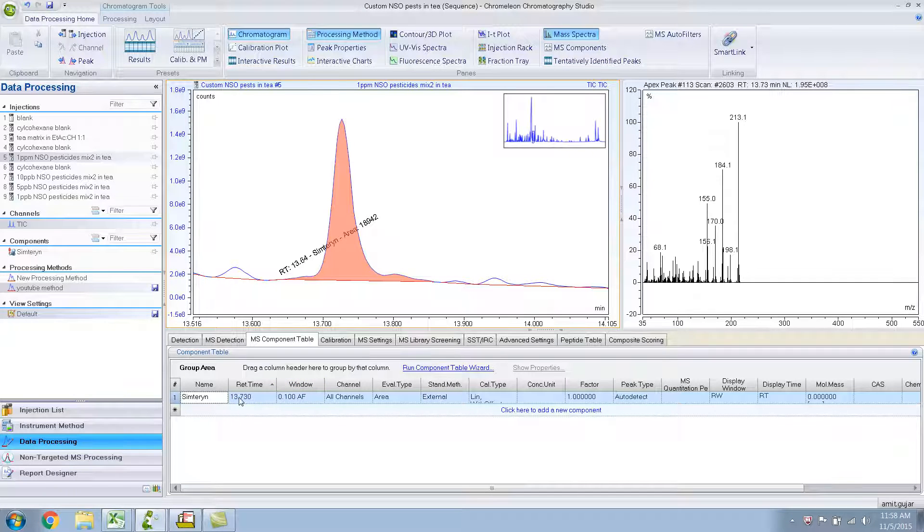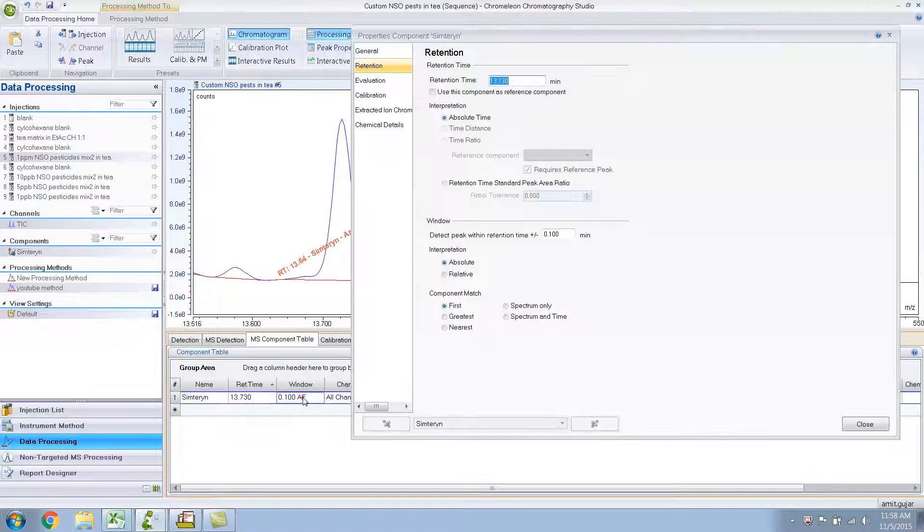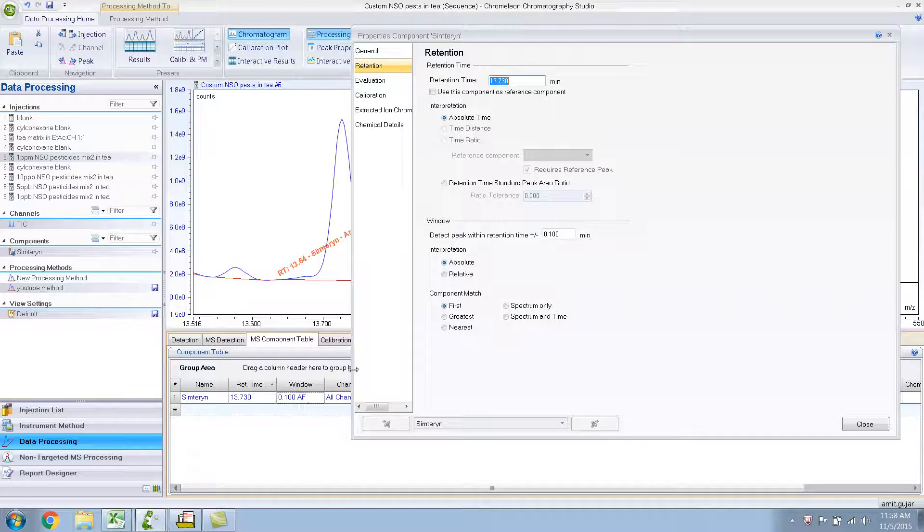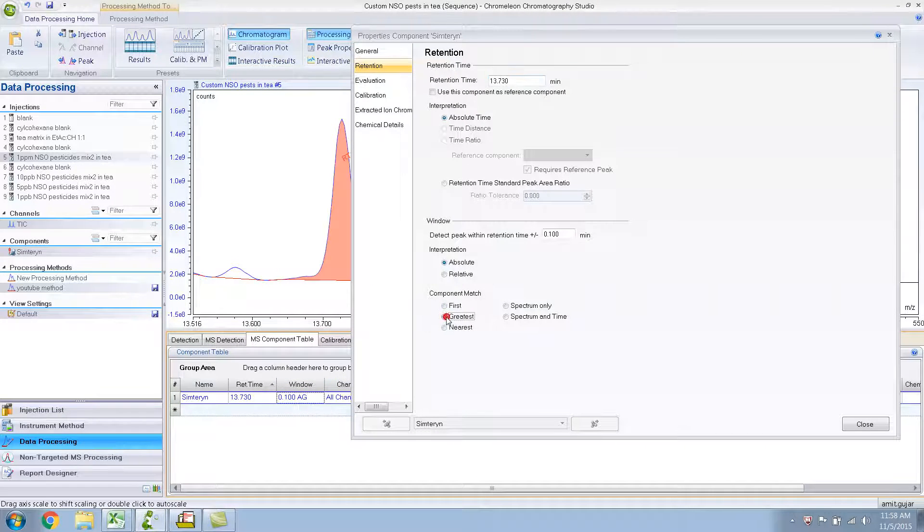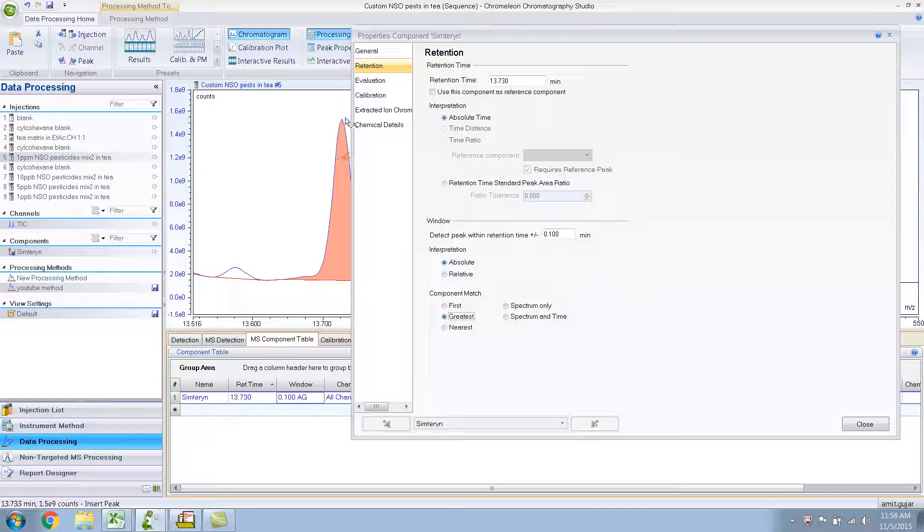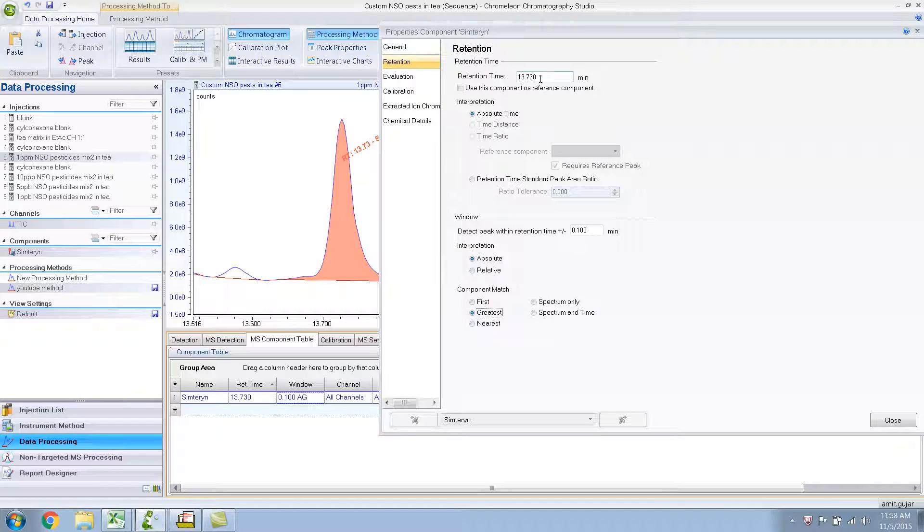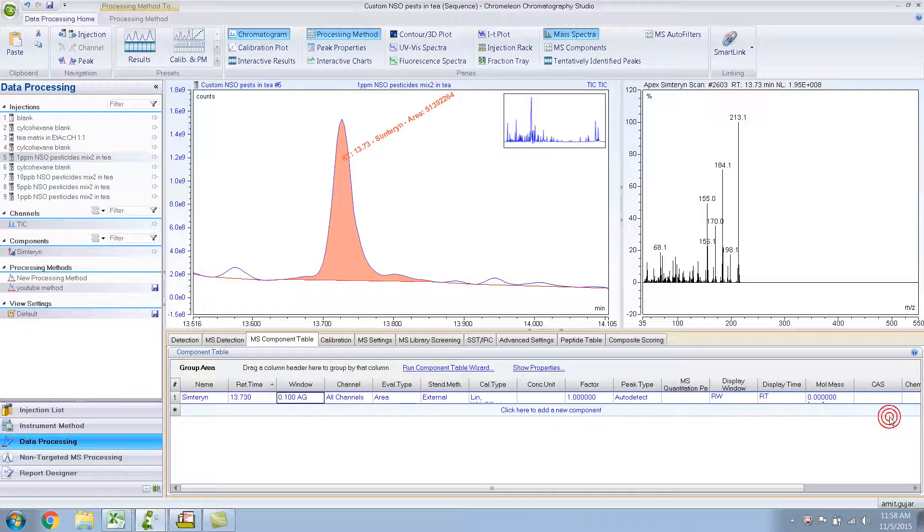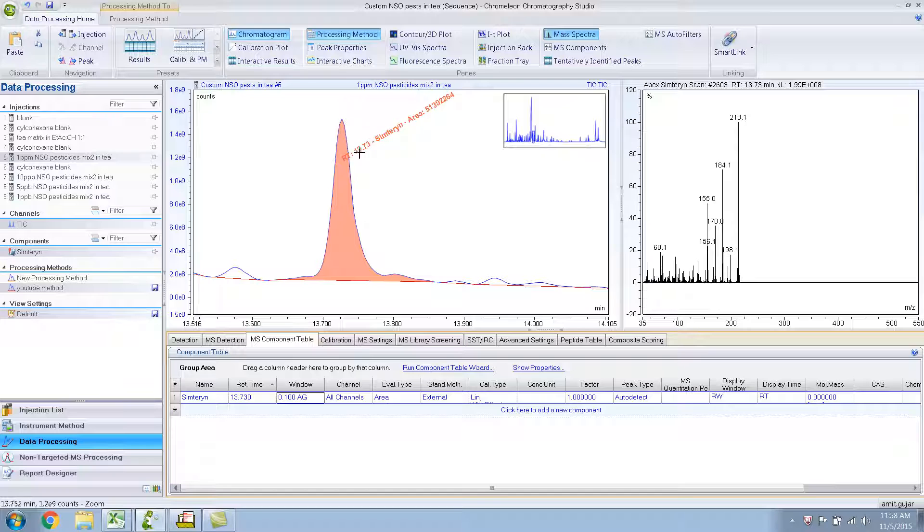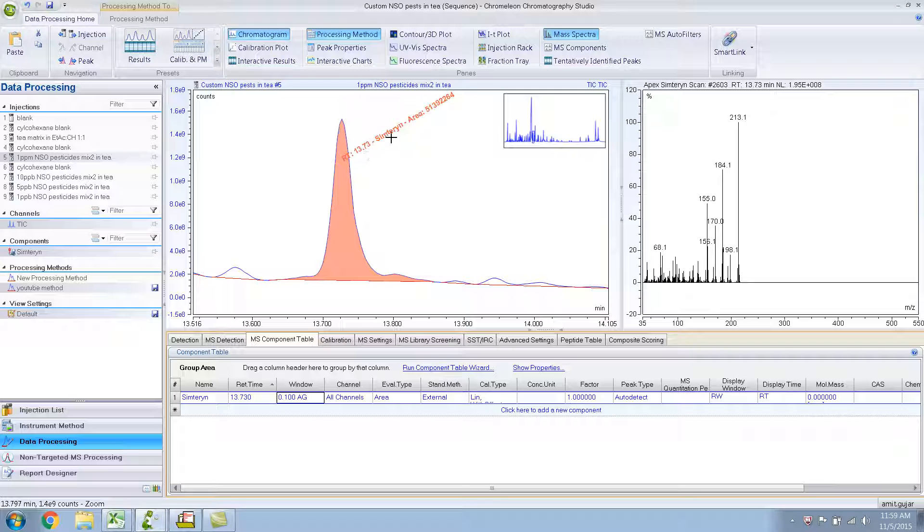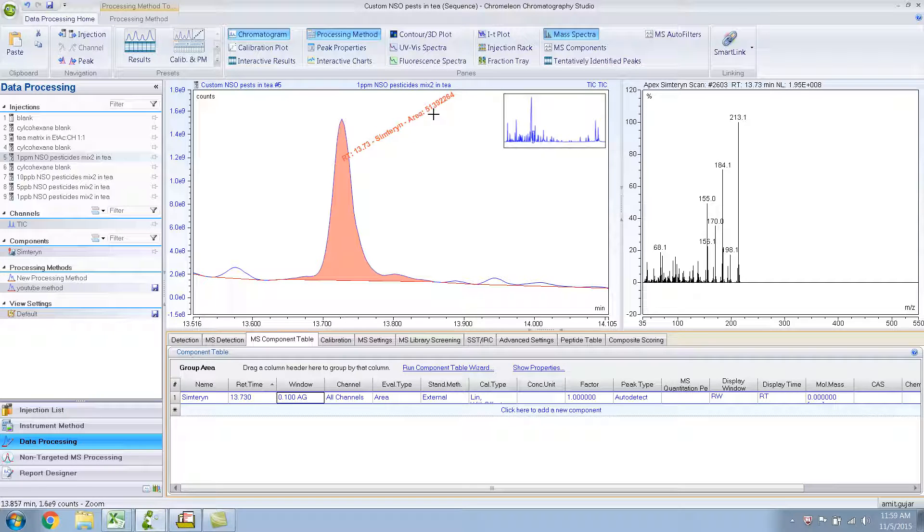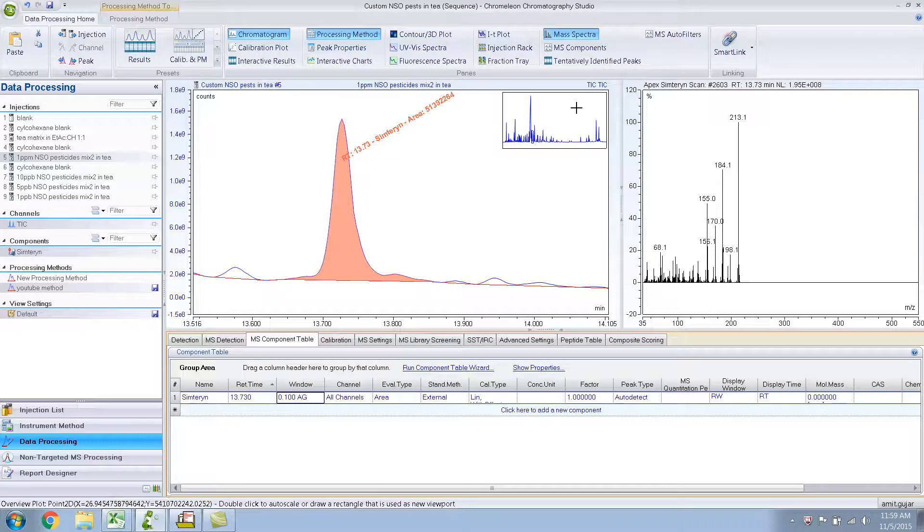So generally, what I do is, I will double click there and do it greatest. If I do greatest, it will automatically pick up the highest peak in this window, 13.73 plus or minus 0.1 minutes. Let me close this for now to show you. It has automatically labeled your peak, retention time 13.73, Simteryn, area, and it shows the area for the TIC, the total ion chromatogram.